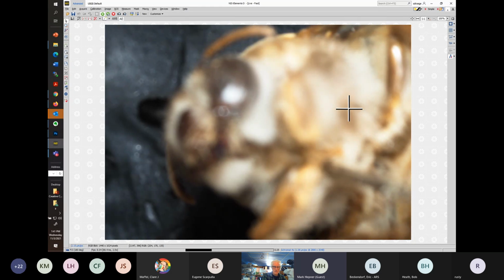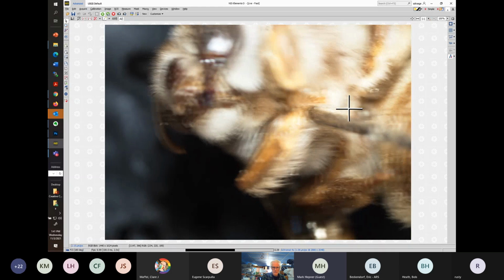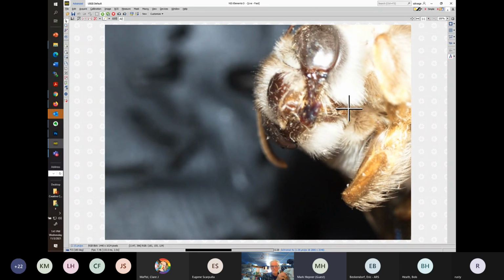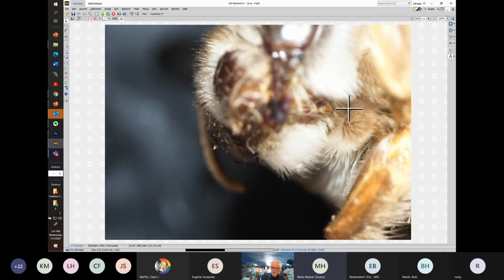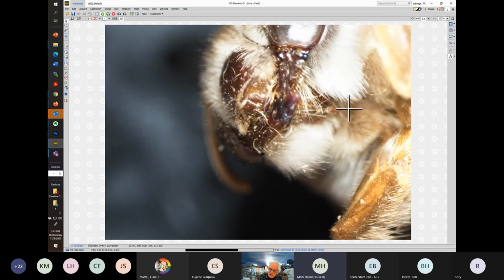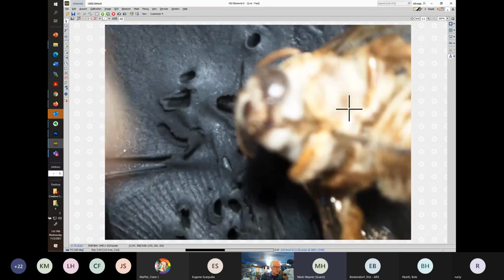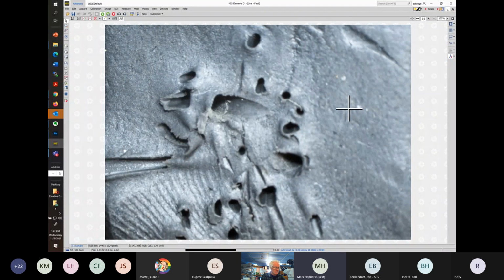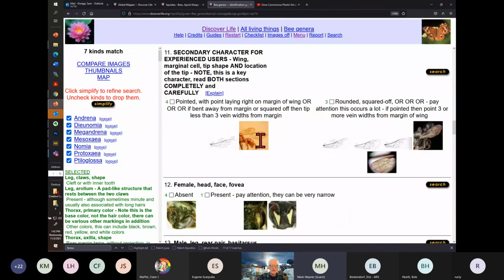And we got something. Oh, that is the pin, not the tongue. So at least on this quick inspection, it looks like the tongue is tucked in there and difficult to see. So we're going to skip tongue characters and see if we need to do that again.